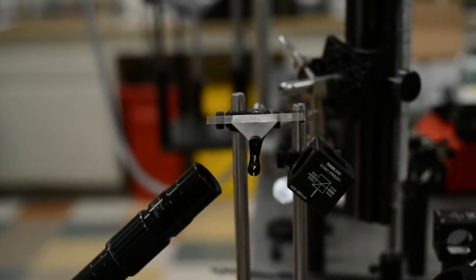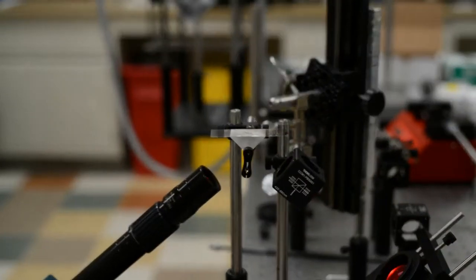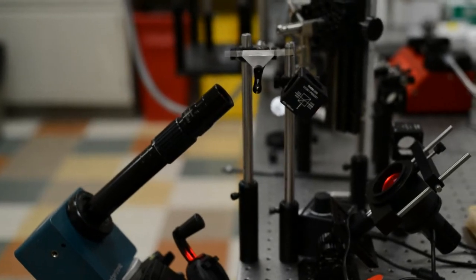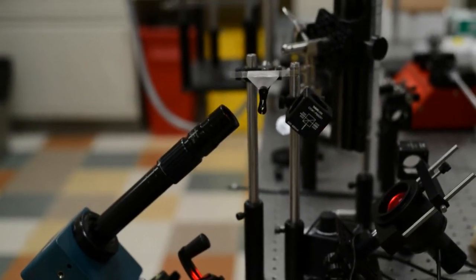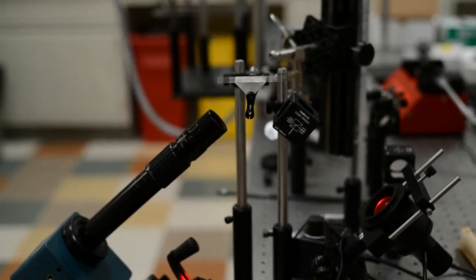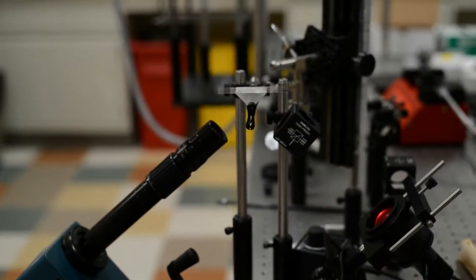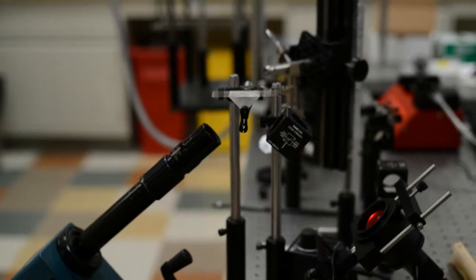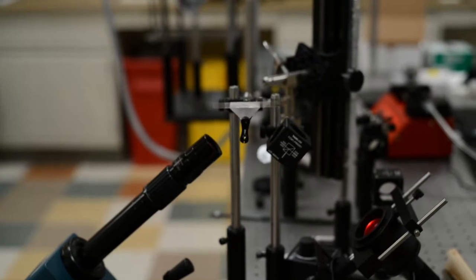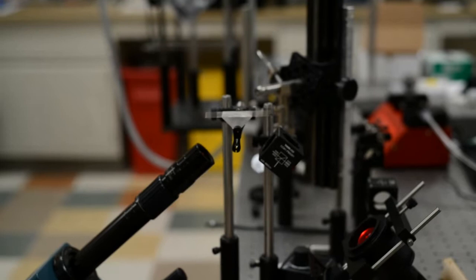And so on top of this prism, let's say that we put a glass with a known radius of curvature, then we can get the exact profile of this glass, knowing that on the top surface of this glass, when light is reflected, it creates what we call an evanescent wave that decays exponentially from the top surface. And basically this glass with a known radius of curvature will frustrate the evanescent wave within nanometers away from contact up until about the wavelength of the light.